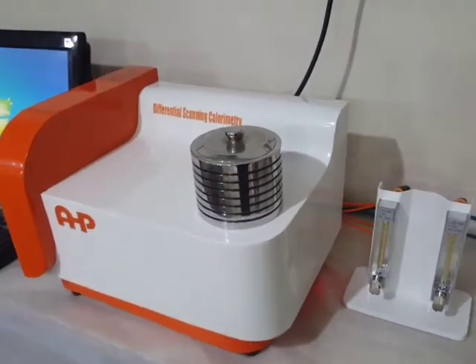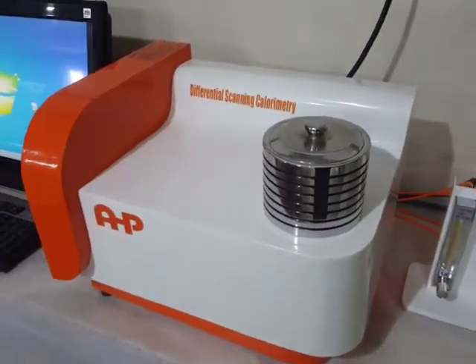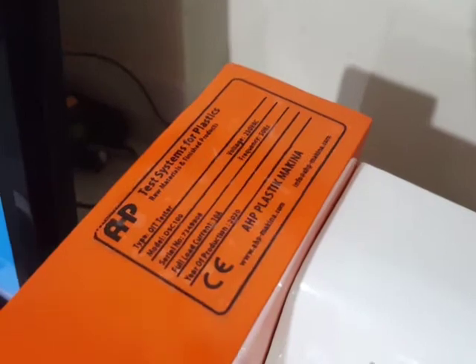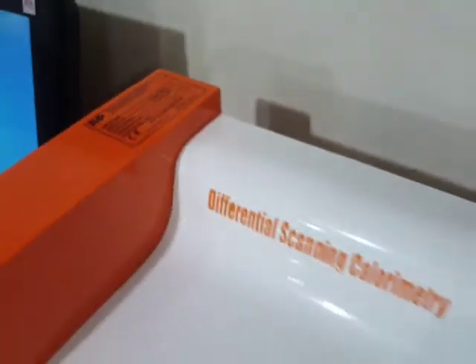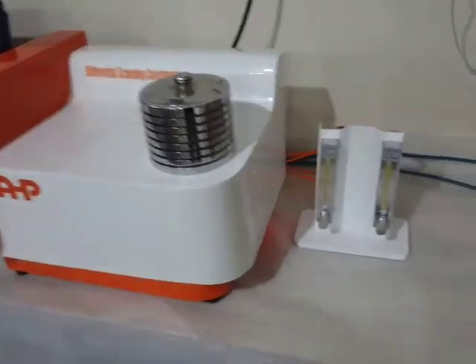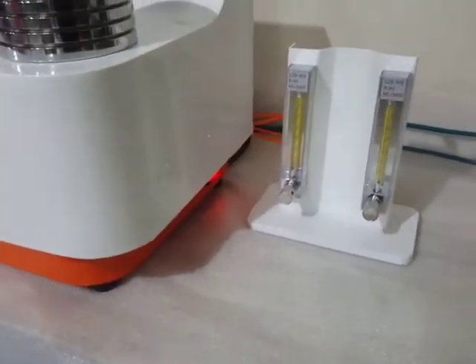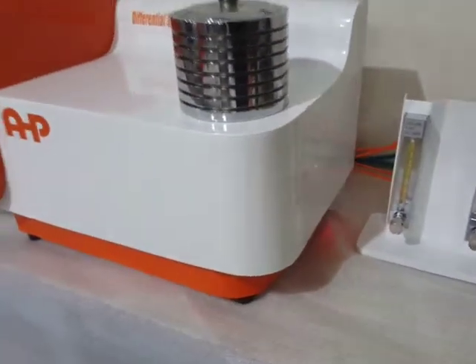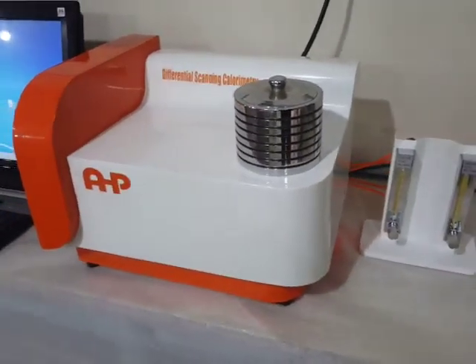AHP differential scanning calorimeter used for testing thermal properties of polymers, like oxidation induction time, melting point, and other parameters in different temperature ranges, including two glass rotometers and a cooling system for the next test to be started soon.